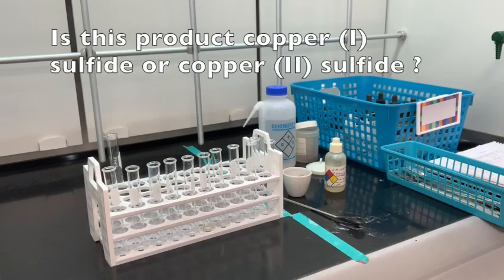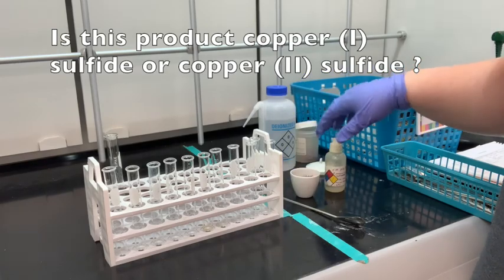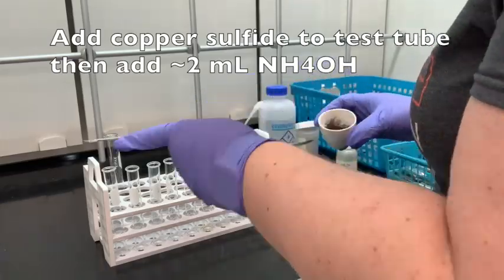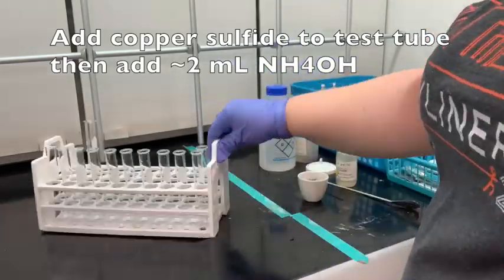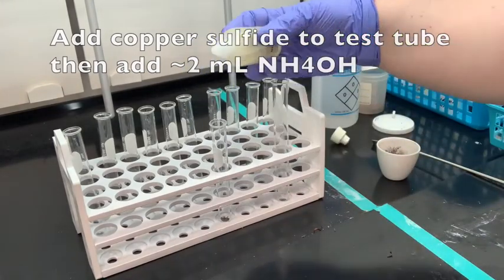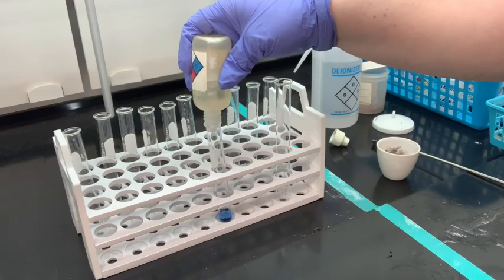Now we want to see whether our copper sulfide compound in here will react with ammonia or not. Remember, we're thinking about the reaction between copper and sulfur.